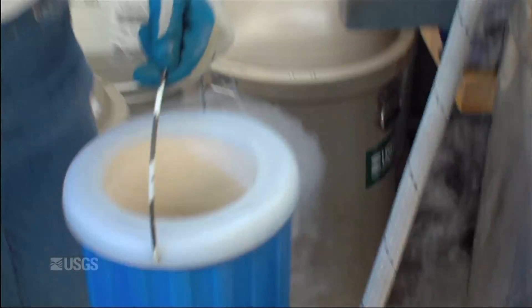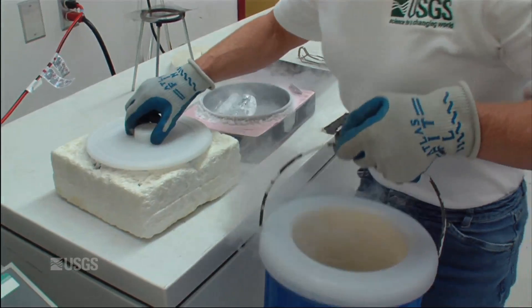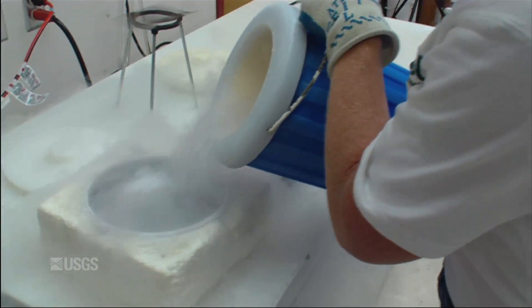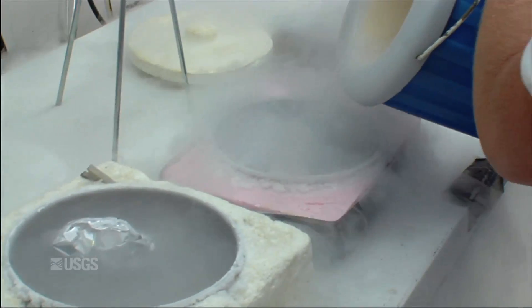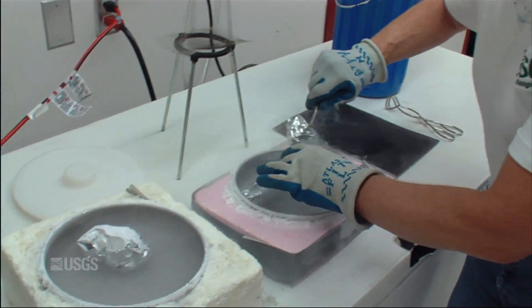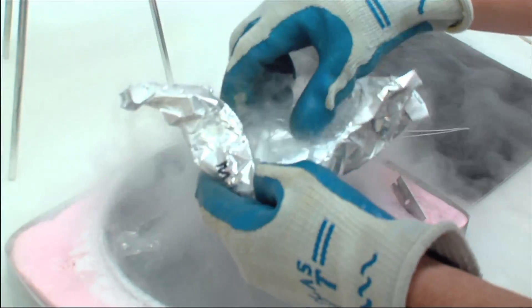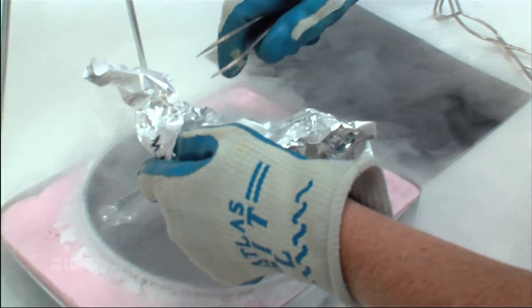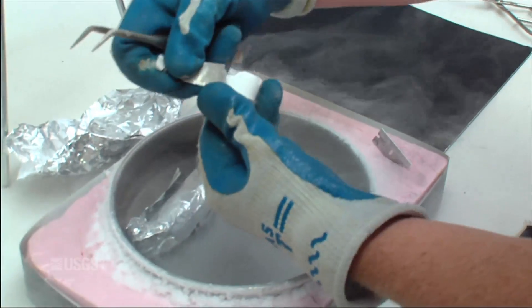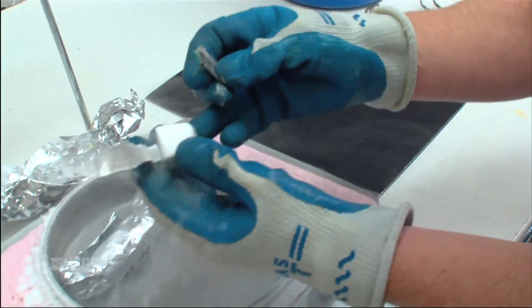Liquid nitrogen is very cold — about 100 degrees colder than the temperature at which these hydrate samples would dissociate and decompose to ice plus gas on the tabletop. In here we have a little piece of methane hydrate enclosed in a soft metal jacket. The samples we make are polycrystalline — they look like compacted snow, but they do contain gas inside.